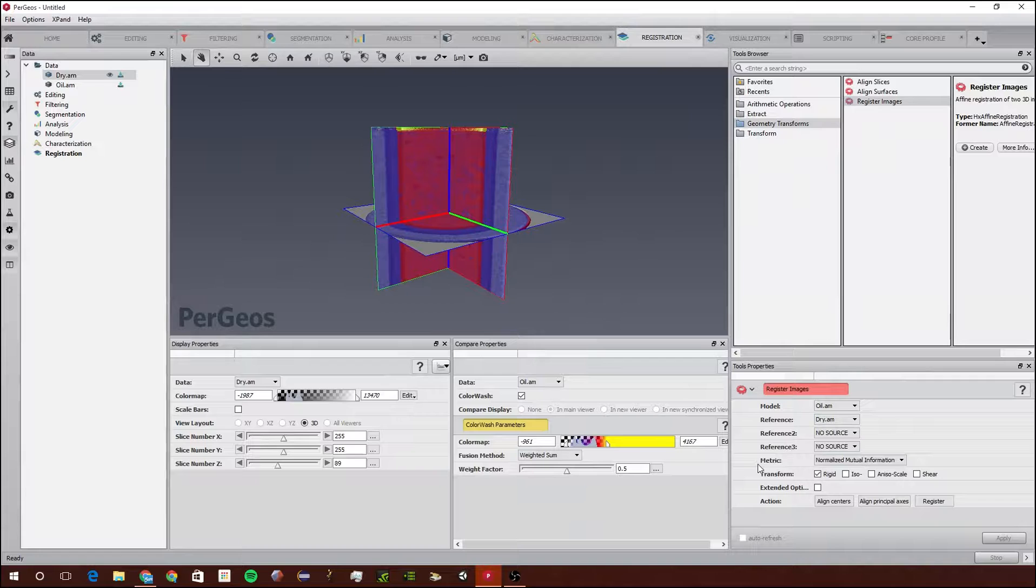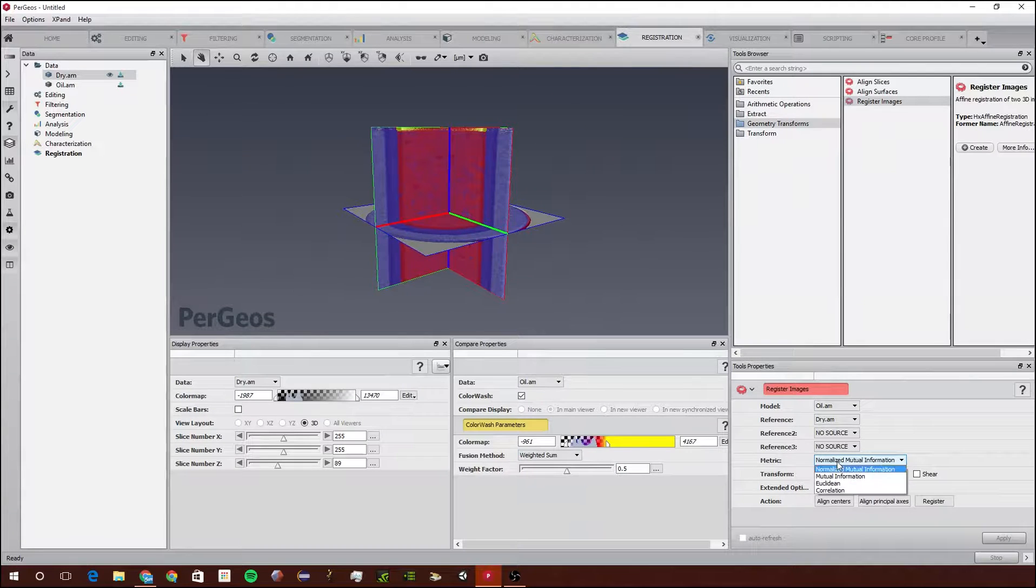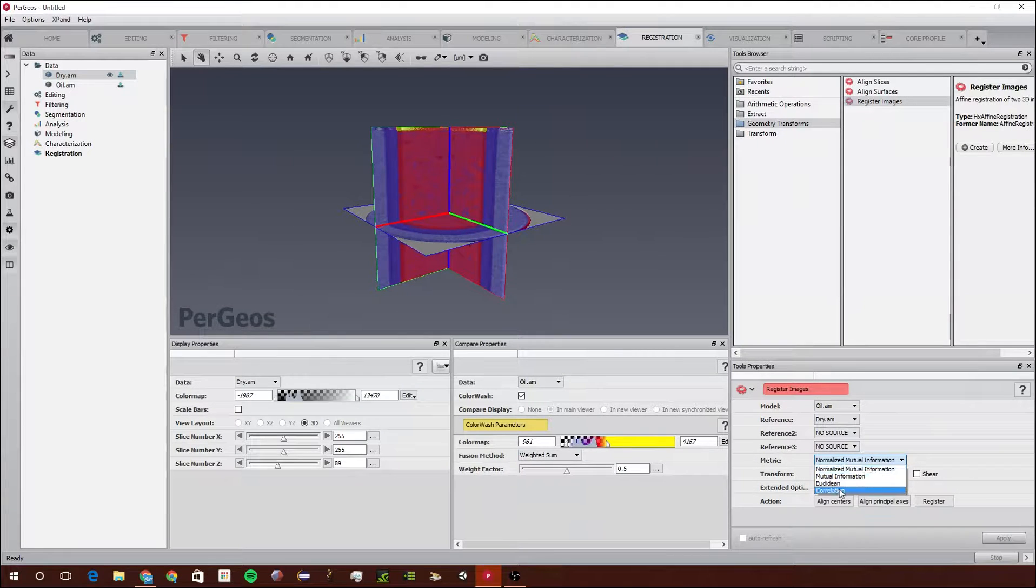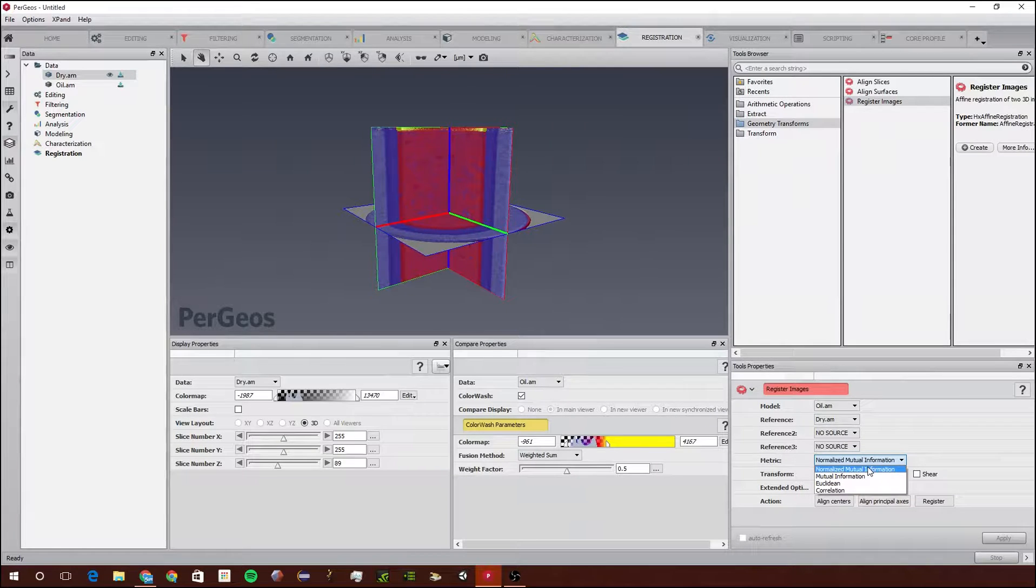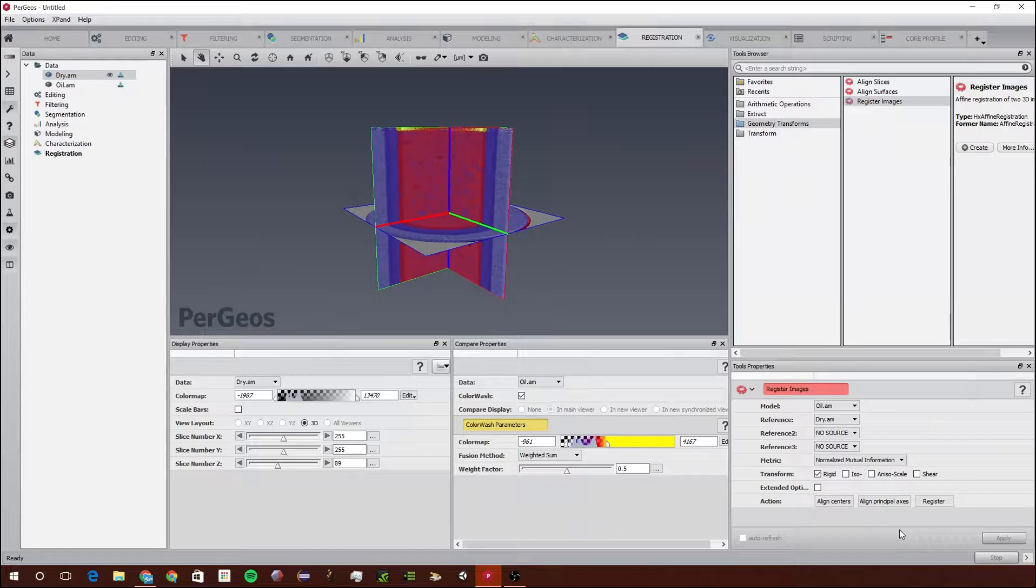This metric is how it's going to tell how close it is to being perfectly aligned. There's many different ways. I suggest just leaving it here or doing more research by clicking the help button.